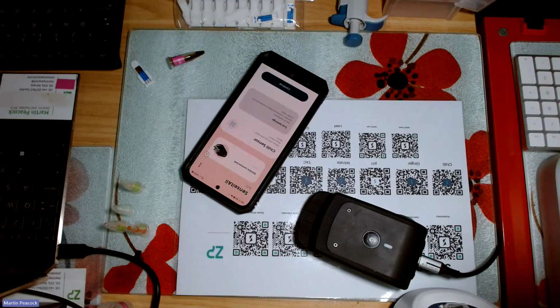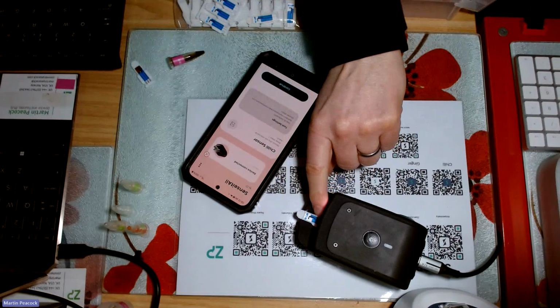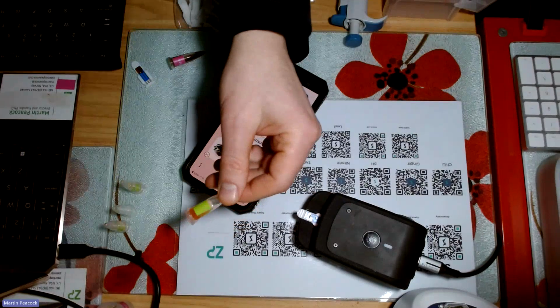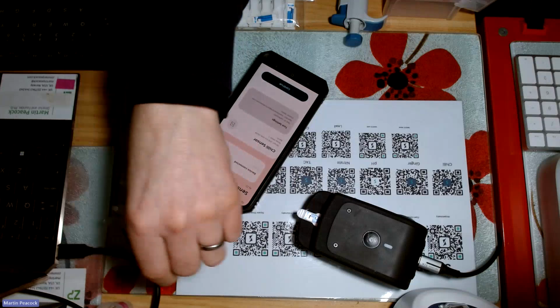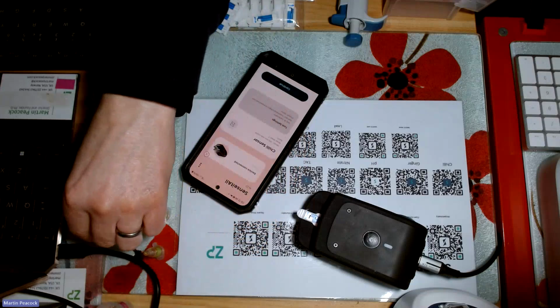I will take a sensor. I will put it into here. I'll close that up. I'm just kind of grabbing some samples. I don't want to say a little bit randomly, but I realize that it is a little bit randomly.